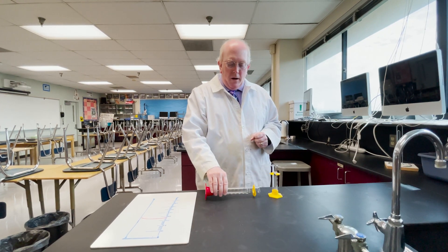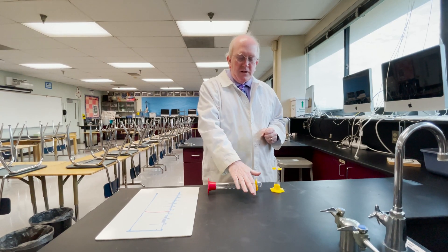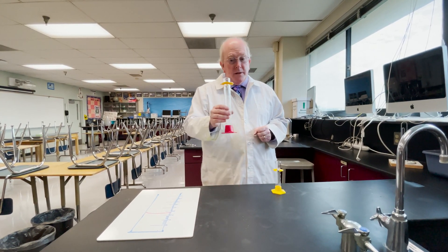When you are storing them, always store them laying down, not standing up. It helps to keep the glass from hitting the surface and they don't break as often, because they're pretty expensive.